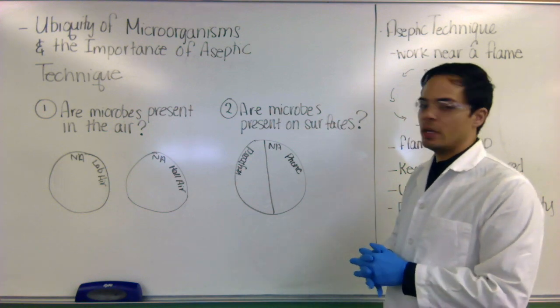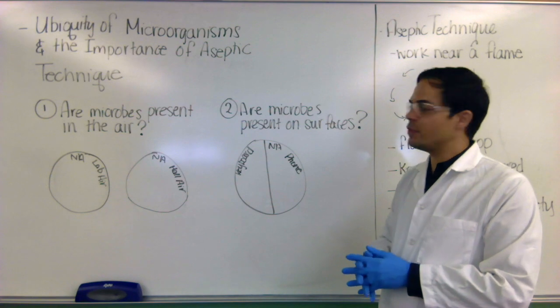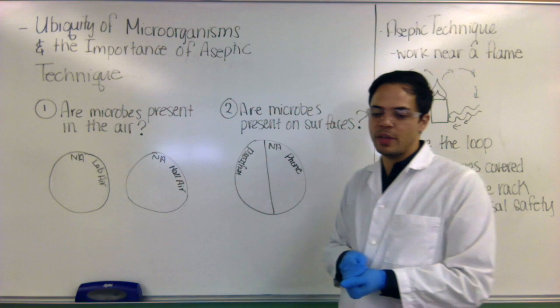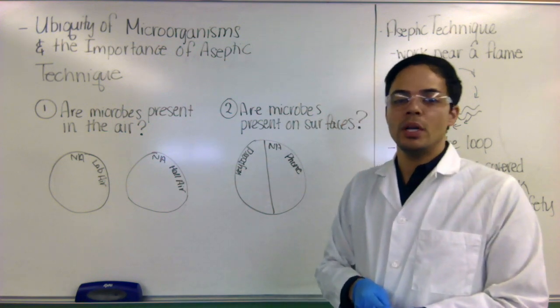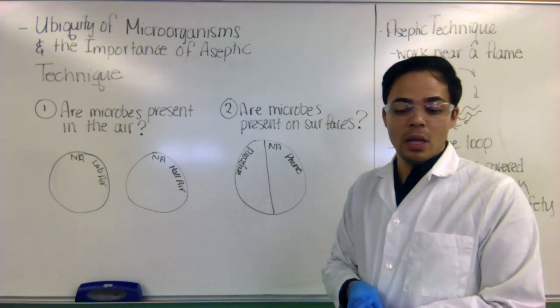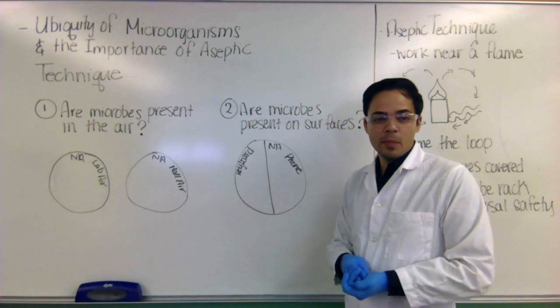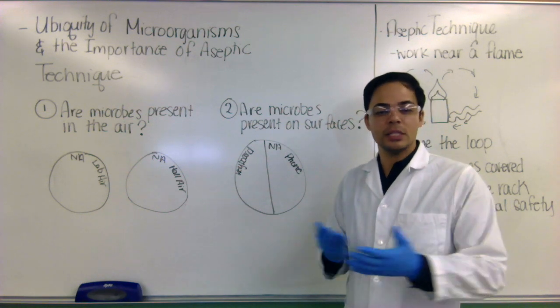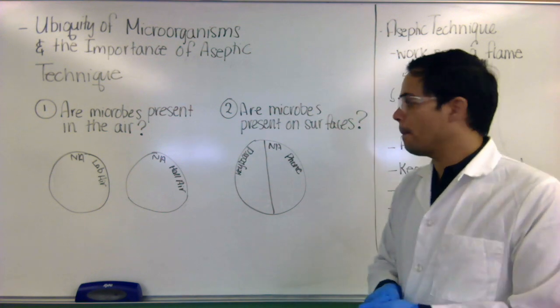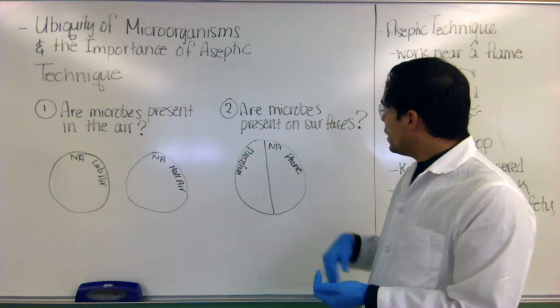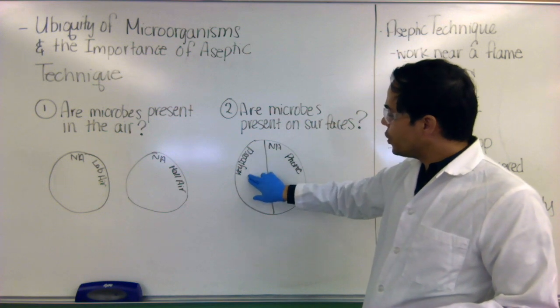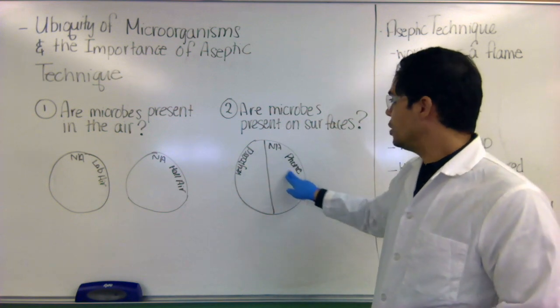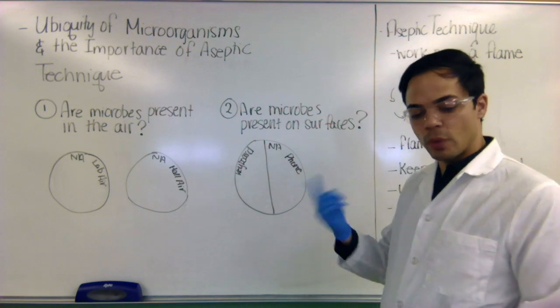The next thing we're going to do is we're going to hunt for some bacteria on surfaces. And we're asking the question, are microbes present on surfaces? And you can choose any surface, the bottom of your shoe, your palm, under the nail. You can do your belly button and compare belly button microbes, which is kind of gross, but our skin also has microbes growing on it. You can do, for example here, your keyboard, your computer keyboard, which is pretty nasty actually. And you can also compare that with your phone. And that's what I'm going to do today.